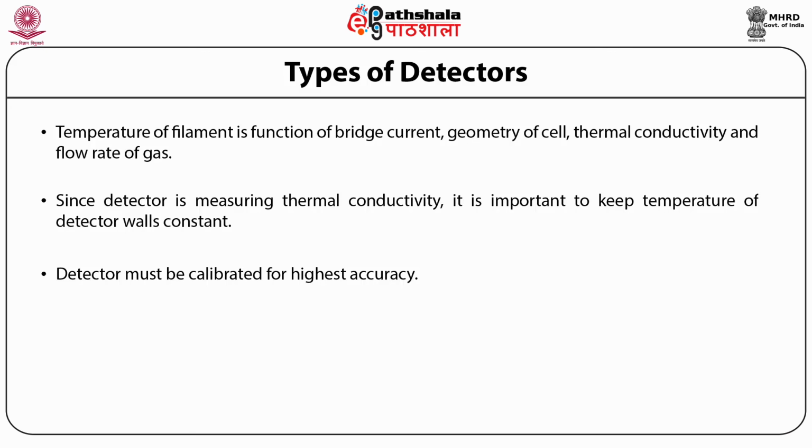The thermal conductivity detector is simple, rugged, inexpensive, moderately sensitive, non-selective, non-destructive, very accurate if properly calibrated, and more widely used than any other type of detector.